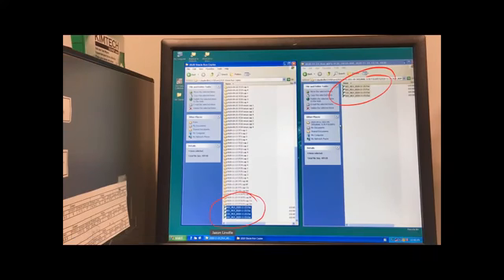I haven't put them into the right thing because it's going to be easier to copy all of them down here and then sort them. All right, but the originals and copies down here. Okay, try not to cut. Try to remember to copy.